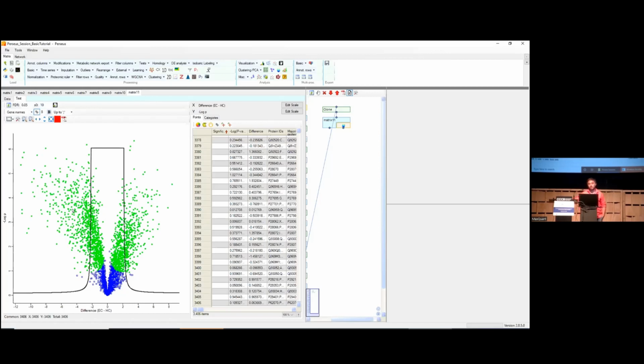The statistic of a t-test is a ratio between mean and variance, and the S0 goes in the denominator as an independent term. This is why you have this hyperbolic shape, because it's asymptotically approaching. When this is very big, it is basically a straight line because you have an infinity in the denominator. So that's the idea.